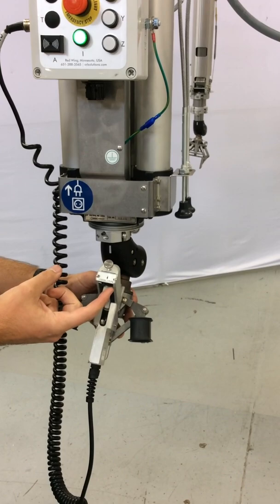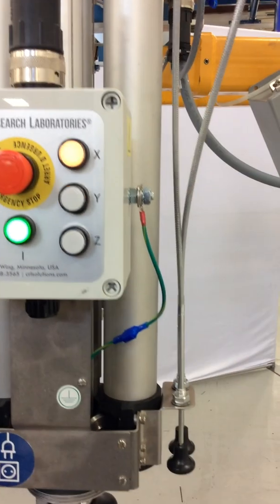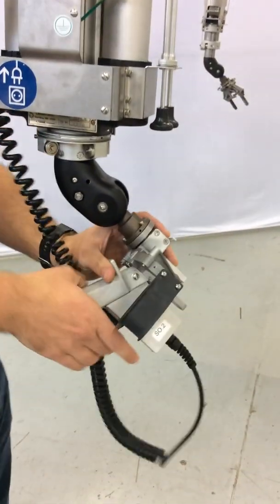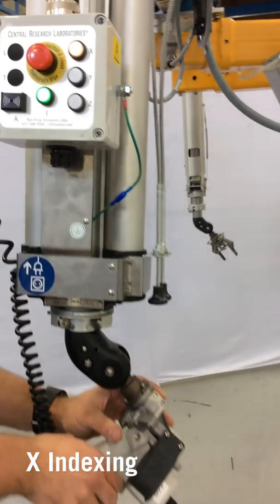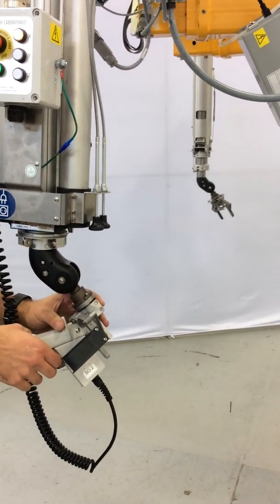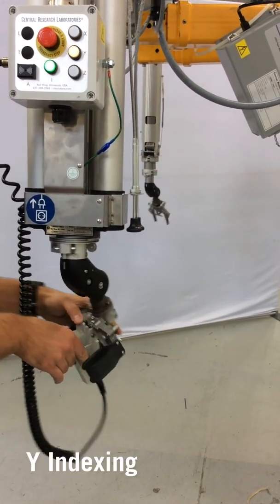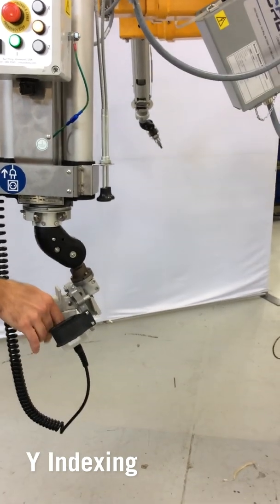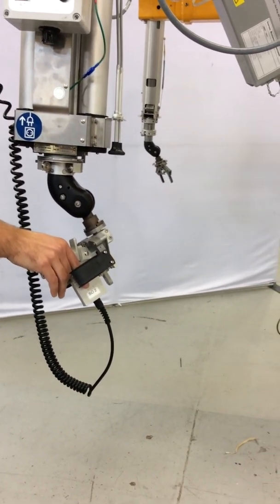The selection switch is on the bottom of the handle, and that will cycle through the available indexing motions — for a GHDE that is X, Y, and Z. To activate the motors, there is a trigger on the bottom of the handle that you push forward or back. Forward and back of the trigger will move the slave arm in relation to the master arm. The indicator lights on the operator control panel will indicate which motion is selected. Y motion pushing forward will move the slave arm forward in relation to the master arm, and pulling back will move it back.